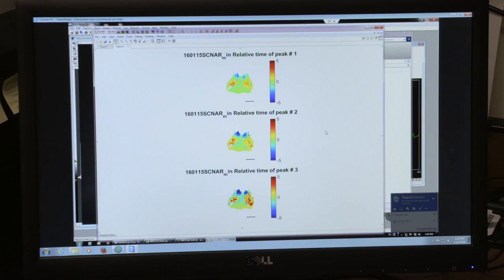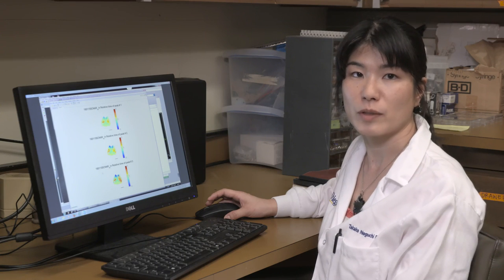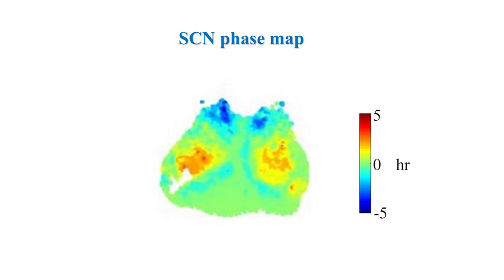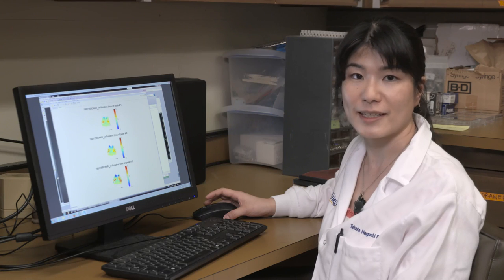This is the phase map of PER2 generated by MATLAB. We use a MATLAB script made by Dr. Raijin at Amherst College. Here we see the phase leading part in blue and lagging part in red. Using MATLAB, we can visualize spatiotemporal patterns of PER2 rhythms.